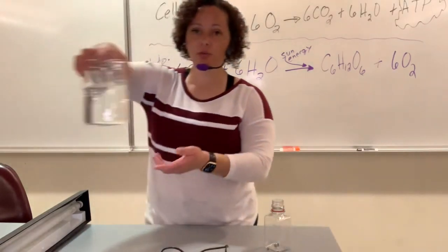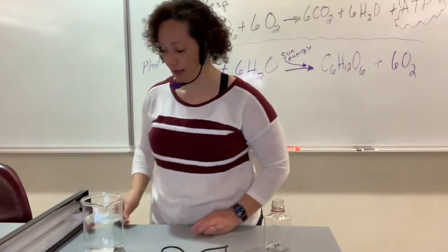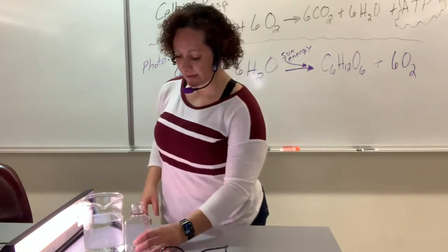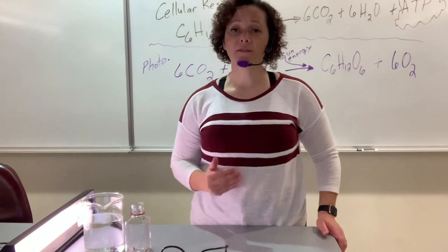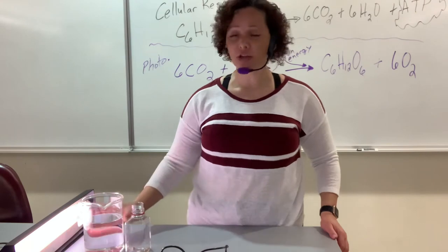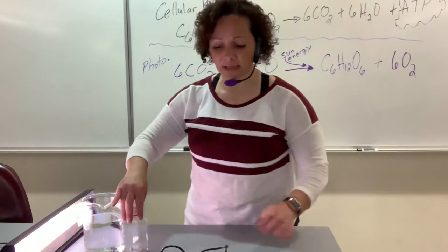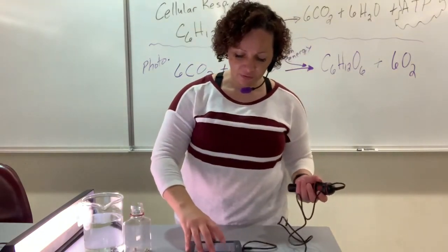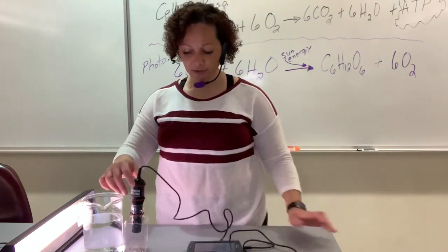So make sure you put some water, a beaker of water, in front of your light. That way when you turn on your light, you put your organism directly in front of the water. Because if you recall, water has a very great ability to absorb high amounts of energy without having large changes in its own temperature. All right, so you're going to put your organism in the light. Make sure you clear your data. File, New, discard, 3 minutes, do it all over again.